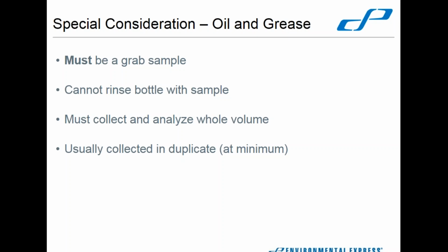And so a common practice that I've seen is that if you're doing your sampling, you actually rinse the sample bottle out with the sample that you are collecting, to give that last clean sweep of the sample container. It's being done with the sample itself so that you don't have to worry about contaminating with anything. You cannot do that with oil and grease because that will bias your collection high.